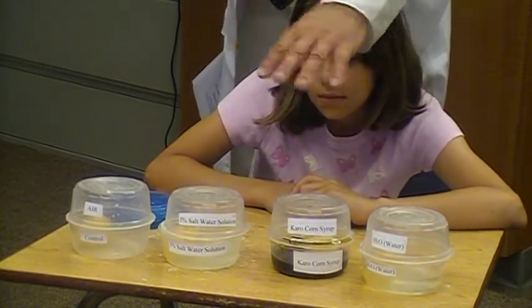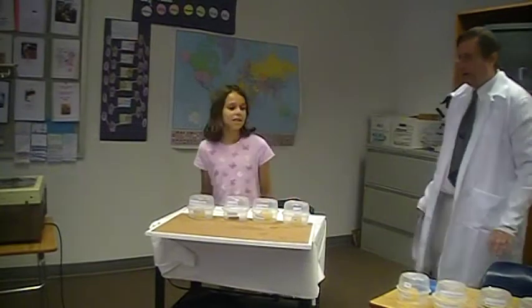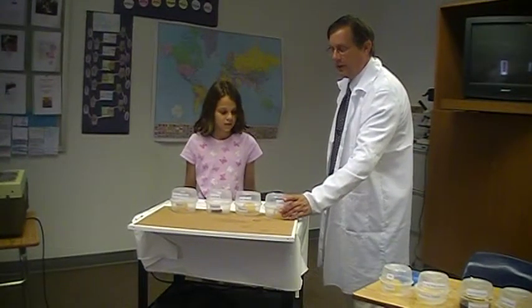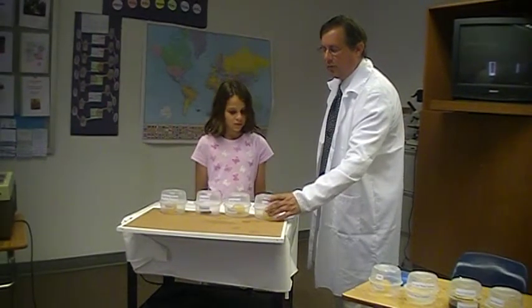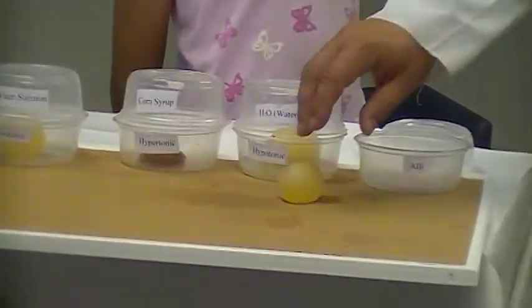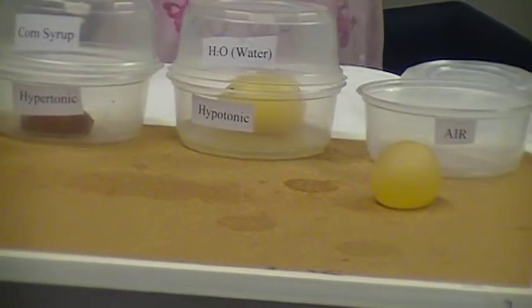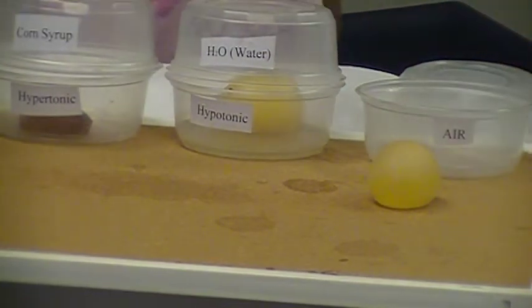We're going to leave these eggs in here for two days before we measure their change. Since we don't have two days to wait, I have previously set aside four eggs just like these in these containers and taken them out so we can see what happens after two days. Julia, can you move over to station three please? The first container here is labeled 'control group.' Julia, can you open that up? As you can see, the egg that was just sitting in nothing but air for the last two days is the same size it was when I placed it in this container two days ago. This is the egg we're going to use to model how these other eggs have changed or haven't changed.